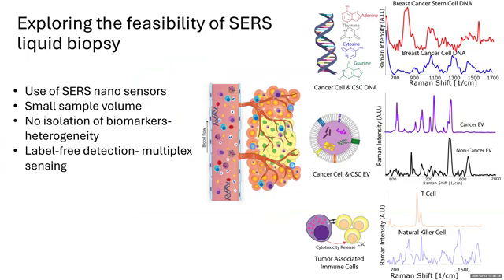So going forward, now my plan is to combine the results from all three biomarkers together. That way we are getting data from the tumor using the structure of DNA and the extracellular vesicles, and we are also getting data from immune cells. That means we are trying to create the information on the tumor immune microenvironment. And I'm hoping to identify new biomolecules that will be instrumental in finding immunotherapeutic cures for hard to detect cancers and treat those cancers.